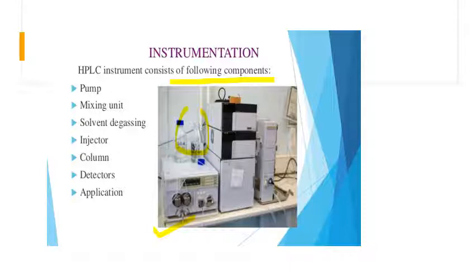Now this is attached to the HPLC pump. The next component is the pump. Then the mixing unit, the degasser, which is also called solvent degassing, the injector by which the sample is introduced, the column where the principle is involved and the separation takes place, and the detector. After seeing all the components, we move towards the whole working process and the analysis in the method.